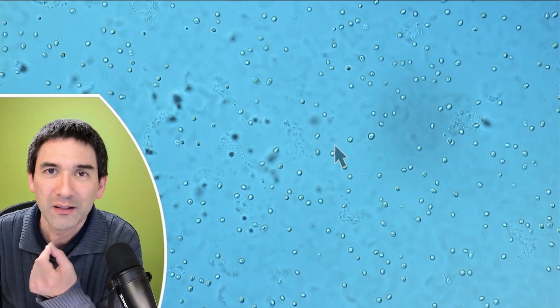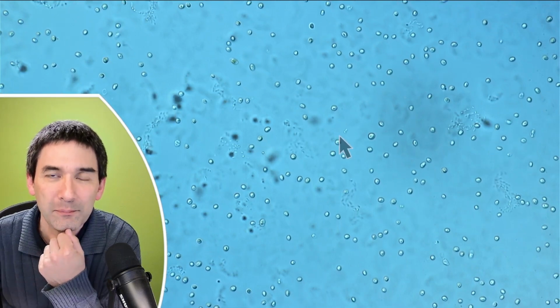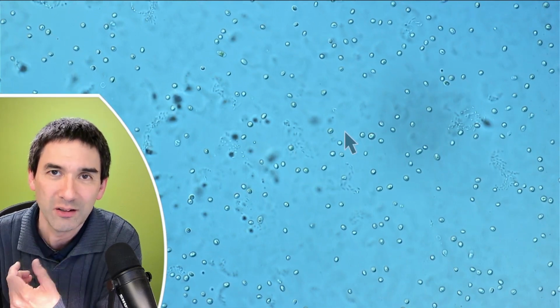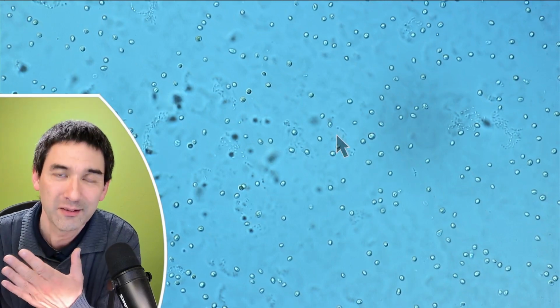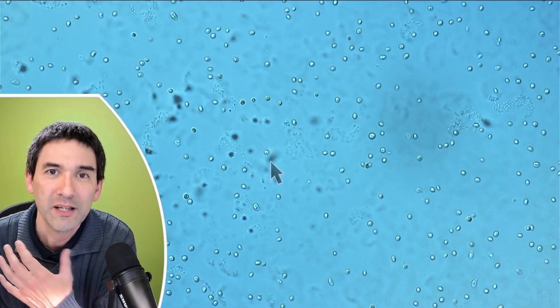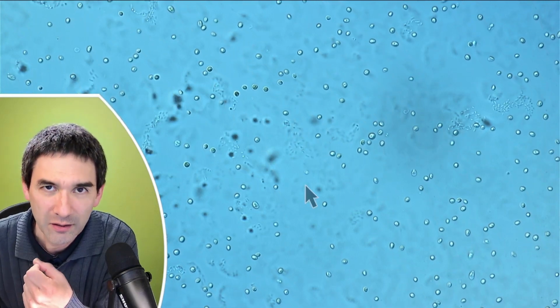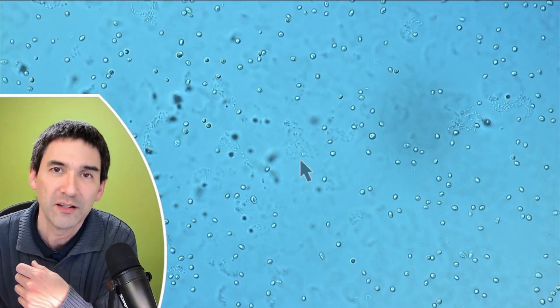So what you have is, and why I like this system so much, is because it shows that randomness in movement of microorganisms can also result in some kind of a directional movement, so to say, that they statistically move towards an area which is more favorable, right? Simply by reducing the runs and increasing the turns as it becomes more favorable.